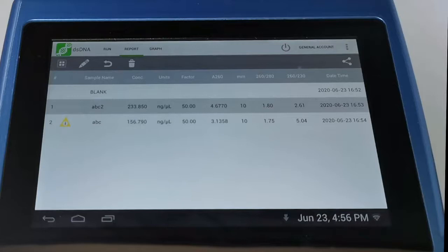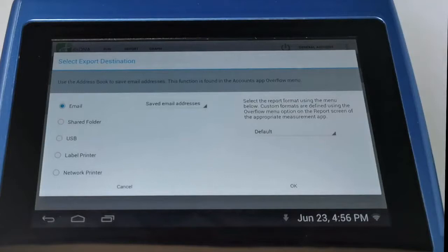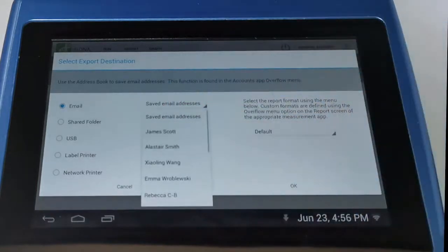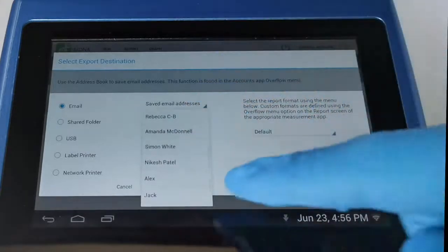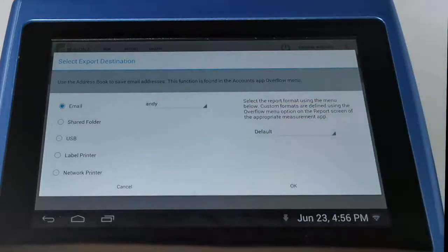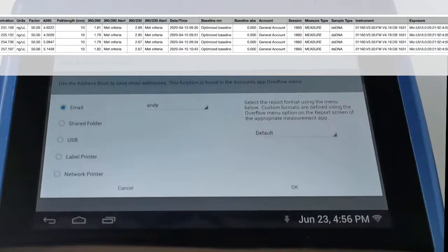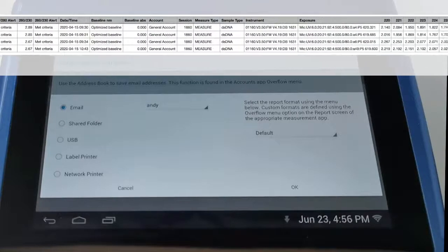And we can select the samples that we want to export and use our share button to bring up our export menu. And so this is one of the really nice features with the DS-11. As I mentioned earlier, we can fully network this system. So we can set this up to have an email address of its own. We can save our email addresses into the system and just select where we want to send it to, click OK, and it will automatically generate a report, send out a .csv file that you can open in Excel or a similar sort of editor. It'll send that to our email address, and so when we get back to the office, it's there waiting for you.